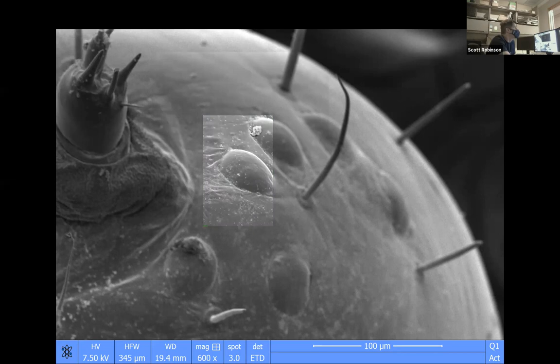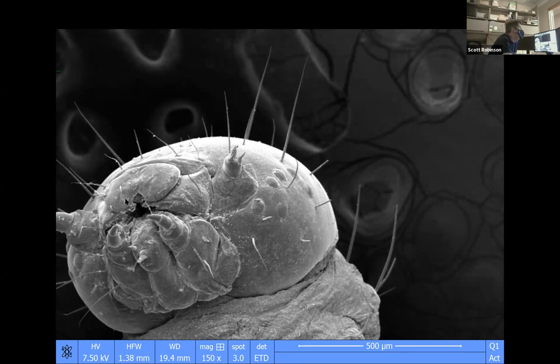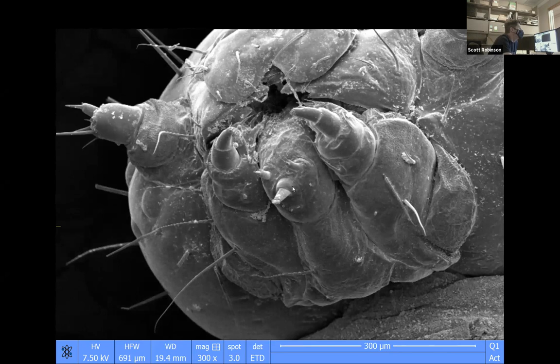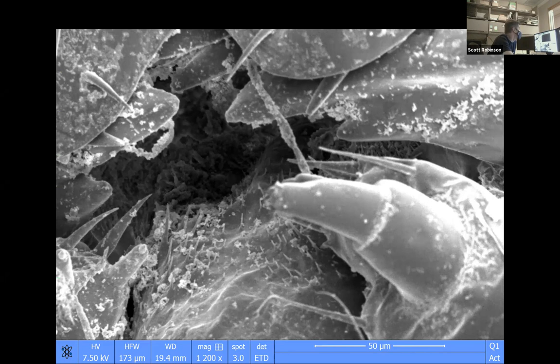So we can see these little spikes sticking out, and this just helps. It doesn't have very good eyes, but it can tell if anything's touching it using all those spikes on its head. And then these things down below are palps that help to taste prospective food. At the tips, they have these little sensory organs that help them sort of taste and smell things that they might want to eat.